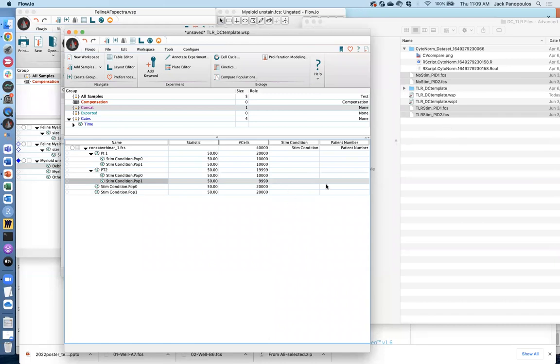So let me move on to the next one. If there are samples with different range of data quality, whether we are allowed to compare these samples together after normalization and data quantification. Well, the judgment call is really going to be up to you, Nafisa, because the problem there is that if you have one poor sample in the batch, it's going to skew your t-SNE, it's going to skew your clustering results.